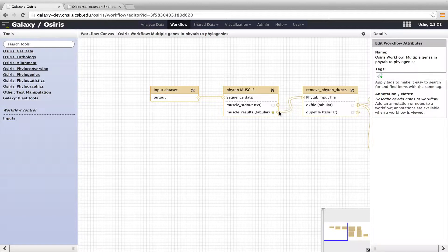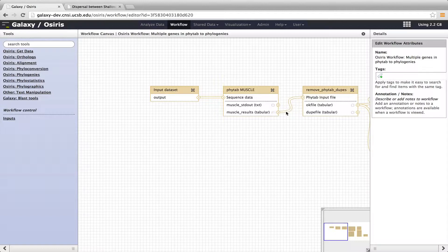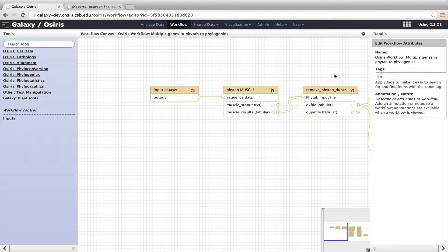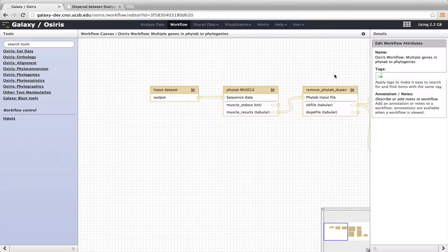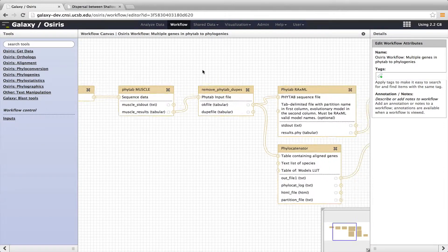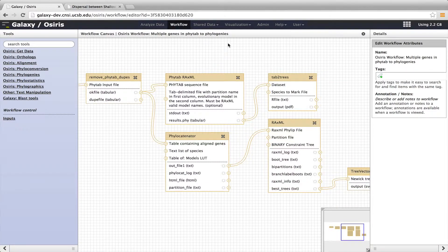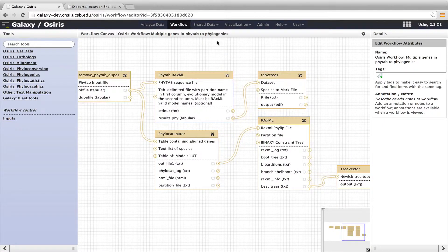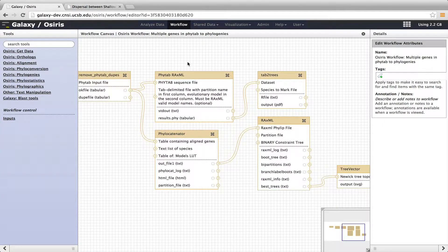That then gets ported into the output of PHYTAB Muscle. The aligned data gets ported into a tool called Remove PHYTAB dupes. And what that is is it removes any duplicates from the data file. So if we had population data that we weren't aware of, like multiple of the same sequences from the same species, Remove PHYTAB dupes removes that. Next, the workflow will separate and go into two different directions.